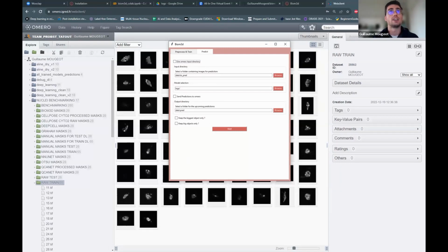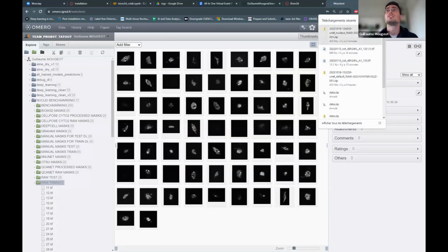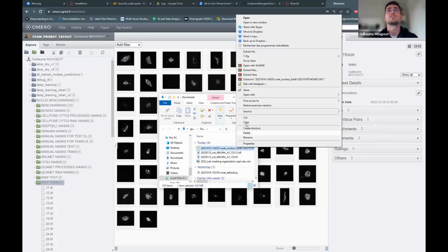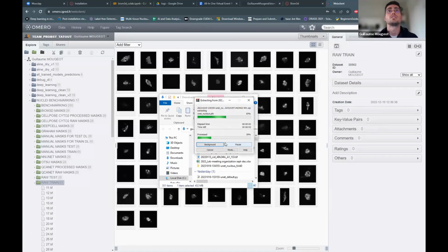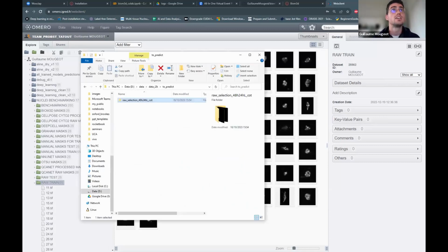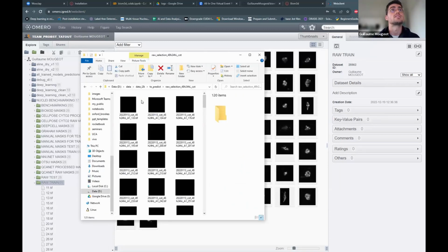And I have it. I just downloaded the model here. Let's see, I can extract it. So this is the downloaded model from my Google Drive. Here it is. I can find the different subfolders here, and I need the datasets. So this is the dataset. Here we go.